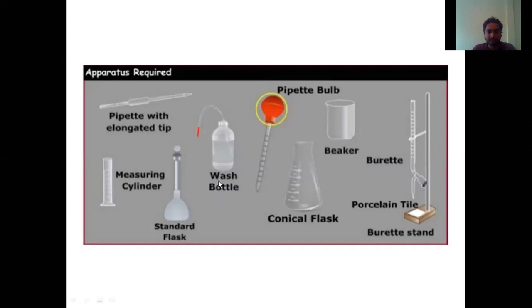Next is the standard flask. Next is this wash bottle. Most of the time we are not going to use the basin for that purpose, so we use this wash bottle — we take water from it. Inside this bottle we are going to place distilled water. Distilled water is either called distilled water, de-ionized water, or pure water. Distilled water is totally neutral water. We use it to clean the apparatus so we don't introduce any other chemicals. If you use tap water, the minerals present in tap water may affect the readings. So we always use distilled water for cleaning the apparatus.